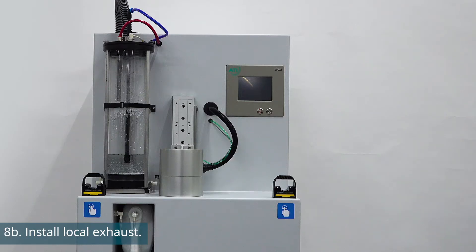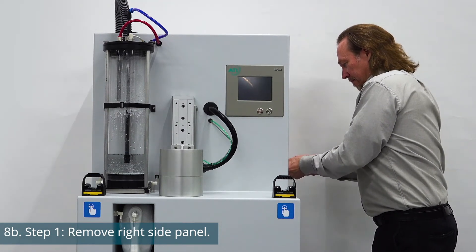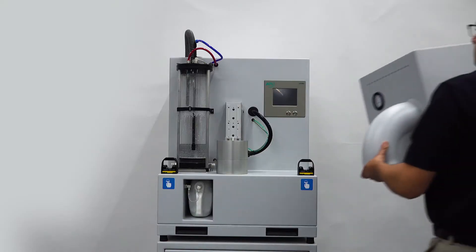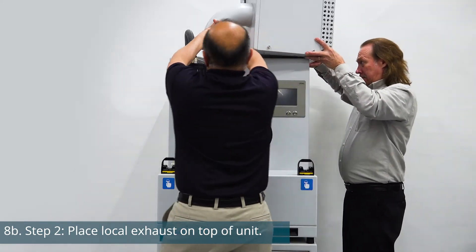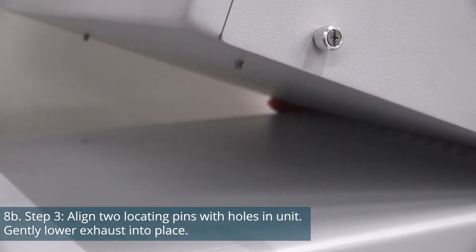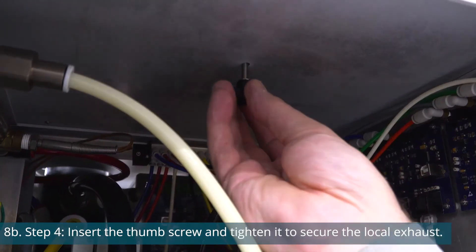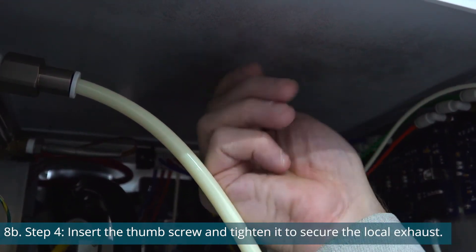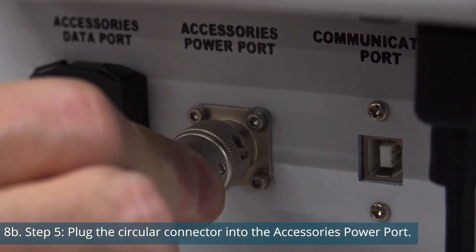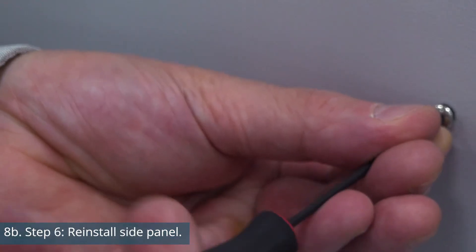If you purchased the optional local exhaust, remove the right side panel using a 2.5mm hex screwdriver. Using two people, place the local exhaust on top of the unit. Two locating pins on the exhaust will match the holes in the top panel. Secure the exhaust using the provided thumb screw — insert the screw from inside the unit through the top panel hole and tighten it. Plug the circular connector into the accessories power point on the back of the unit, then reinstall the side panel.